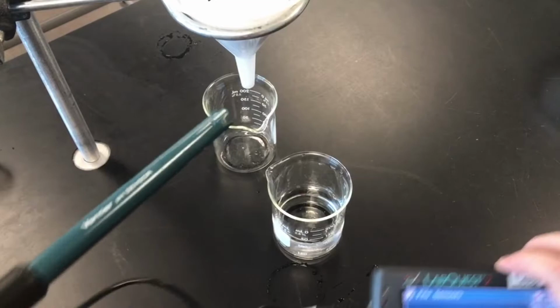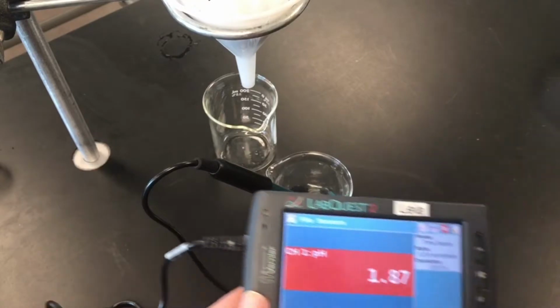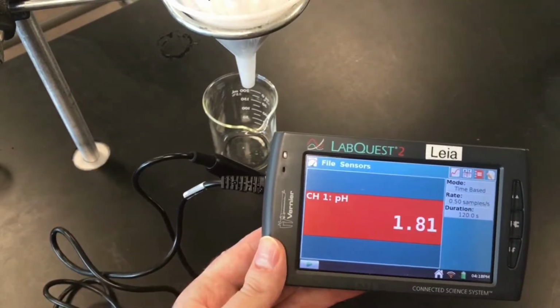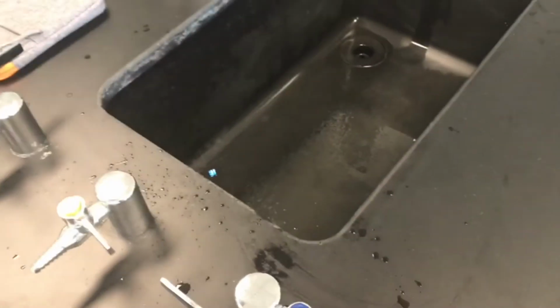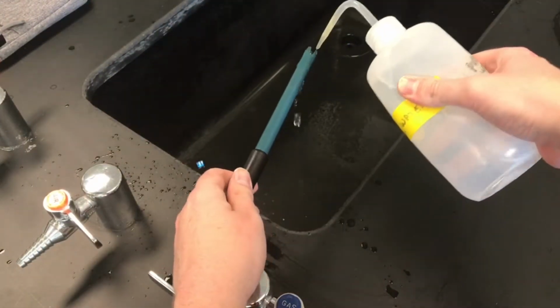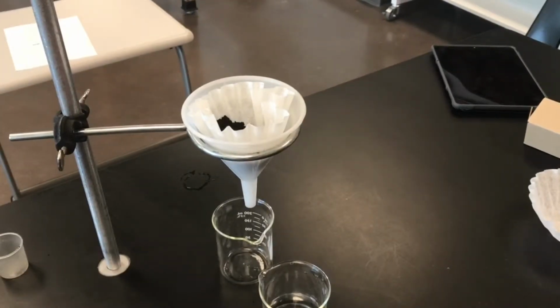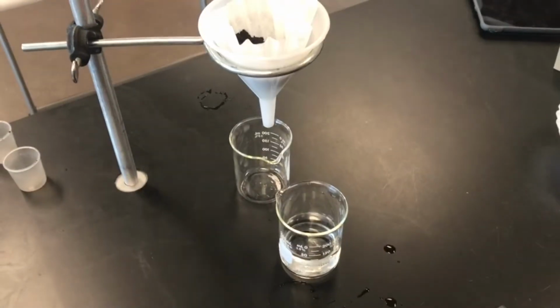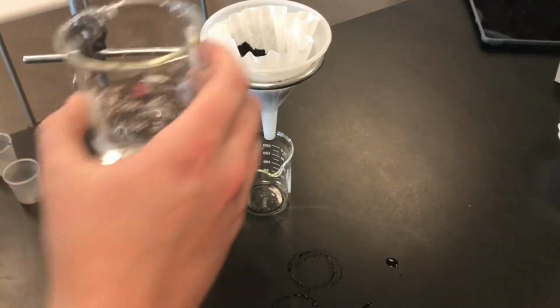And then I'm going to take an initial reading. So this is the initial pH of my sulfuric acid solution. It's going to give you a live reading. Just record when it starts to stabilize. Again, I'm going to spray this off when I'm done using it. All right, so once I've got my initial pH reading, I'm going to take my sulfuric acid solution and I'm going to slowly pour it down through my soil.